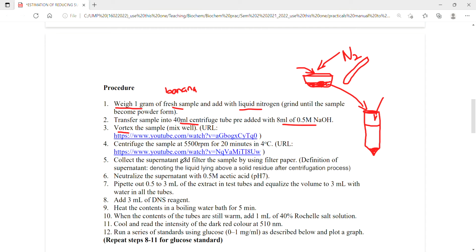In the laboratory we can't use spoons, like what we do to mix tea or coffee once we put the powder in, but in the laboratory we vortex it. It will create a swirling effect, a whirlwind kind of effect, to mix whatever needs to be mixed without the use of a spoon. If you want to understand better how the vortex instrument is used, go and watch this video.